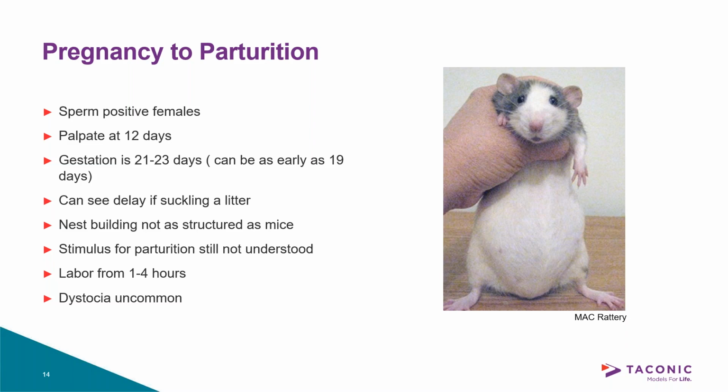They don't really build nests like mice do, these nice big dome structures, but you can give them other types of nesting material. They still like to have enrichment, just don't expect them to build a nest like a mouse.